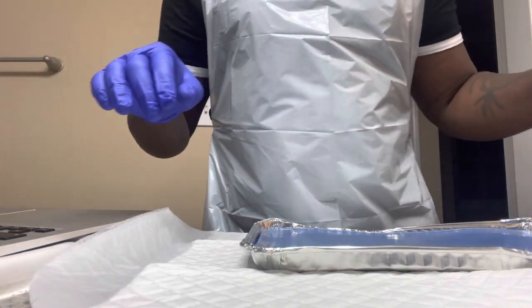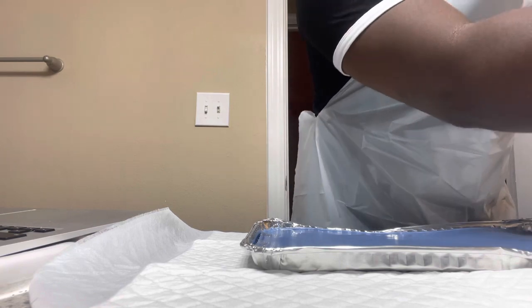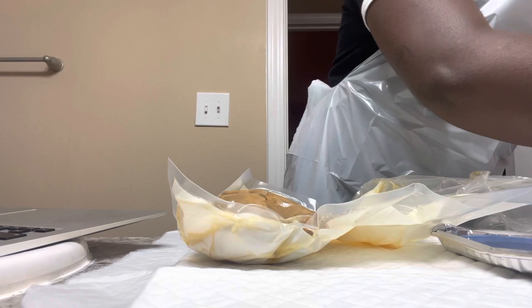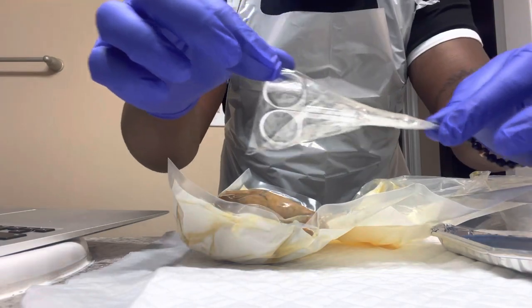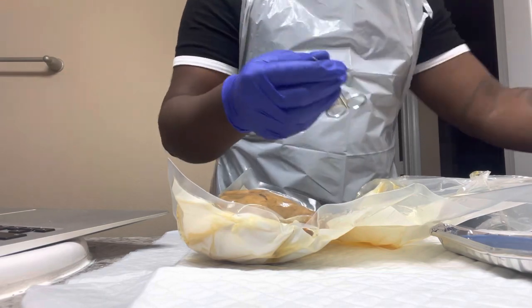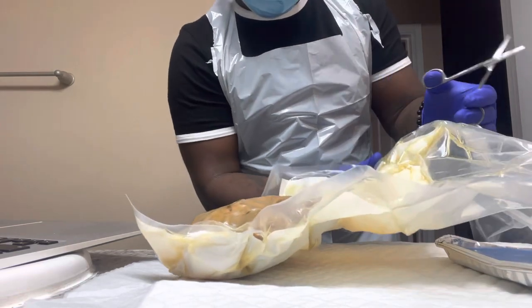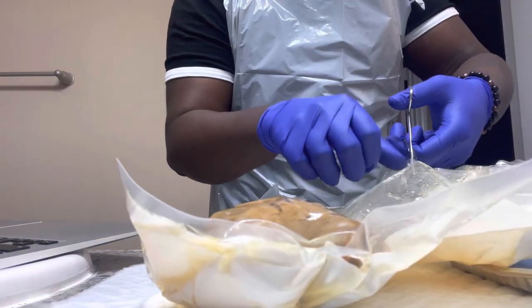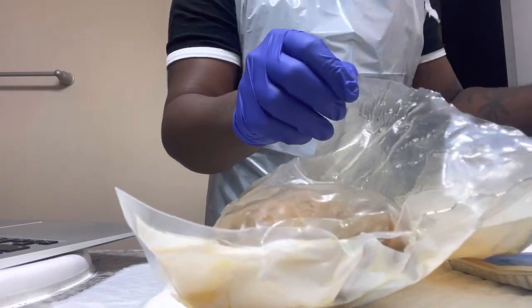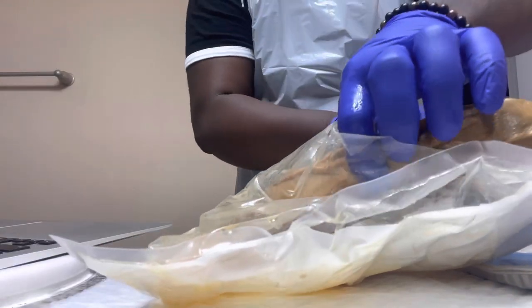Okay, so I am getting ready to take little Wilbur. I've named him. I have my scissors here. I'm gonna cut open the bag. Okay, let's do this. Oh, I'm stressed. This poor pig, he ain't asked for this life. All right. I don't even wanna grab it. And I call myself wanting to be a nurse.